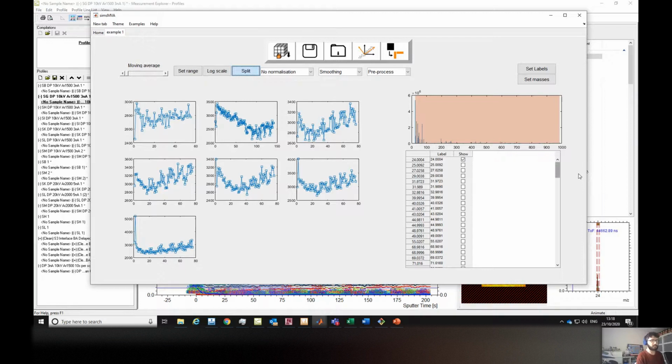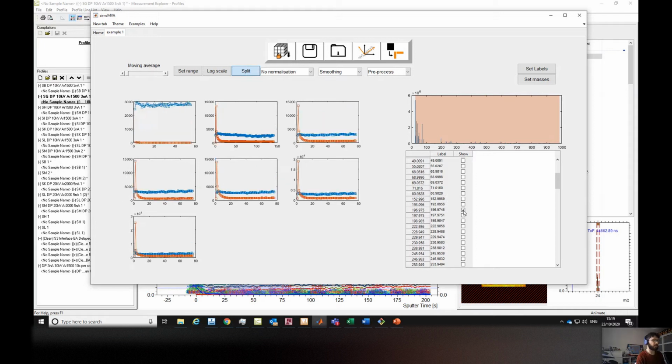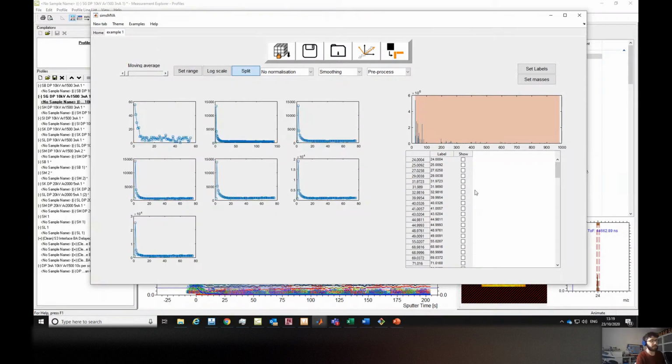As I said, we covered this with gold nanoparticles, right? So let's look at the gold. If you look at the gold ion profile, you can see the first sample actually didn't have any gold. Let's compare, let's remove that and put some polymer related peak.